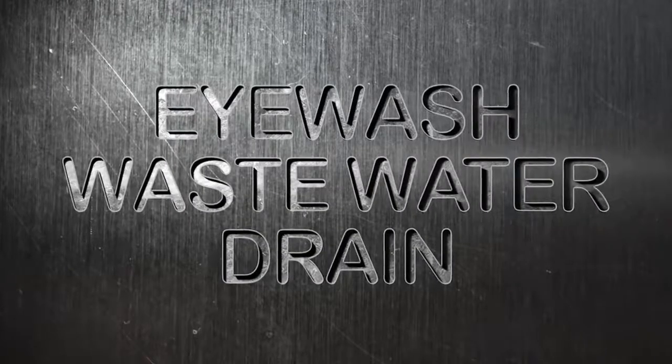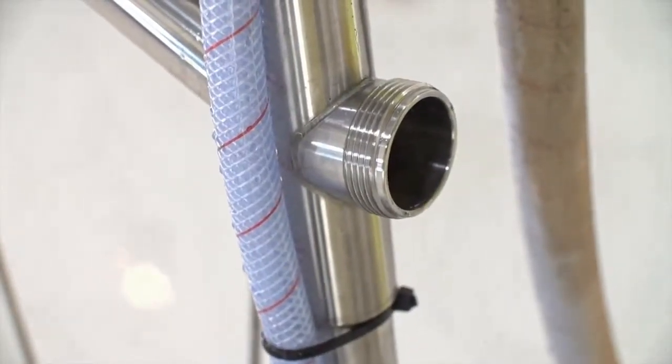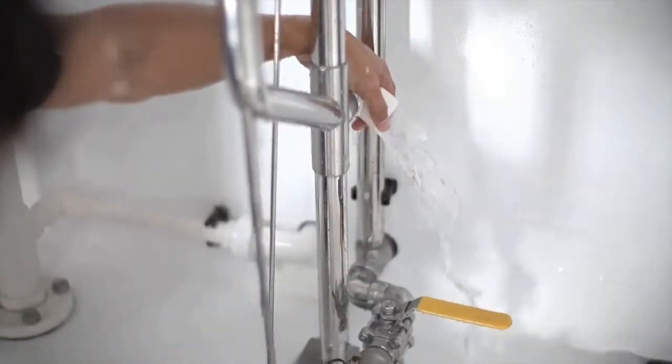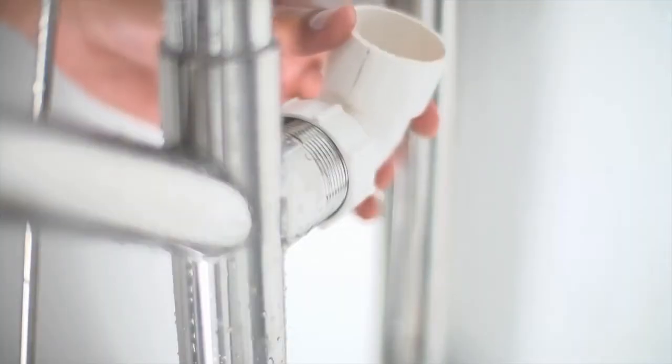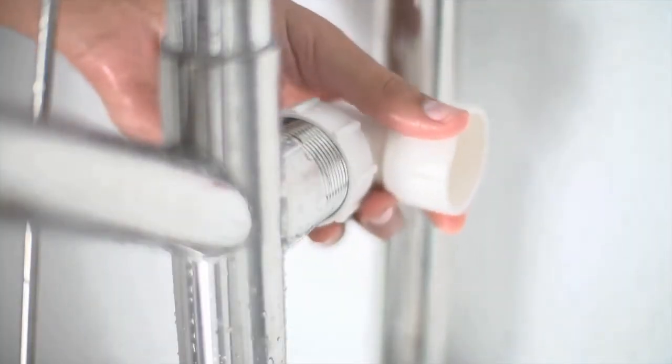Eyewash wastewater drain. Debris build-up in the drain means costly maintenance. Ashley's drain is non-blocking and allows the water to pour harmlessly onto the ground, or it can be plumbed away with PVC one-and-a-half inch BSP fittings so contaminants may be disposed of safely.